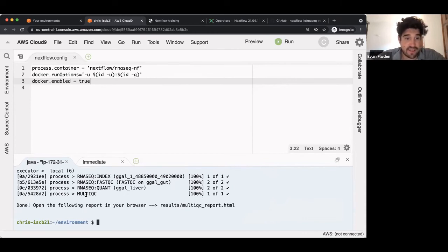We just ran something from GitHub that is completely independent. It could have run with different containers. It could have been run from anything. So that's the kind of power of the ability to combine containers with GitHub and pull this itself. And this is a really useful feature to be able to do. So I'll just copy that into the chat in case anyone is missing that command or wants to see that.